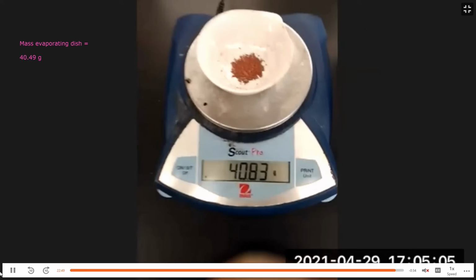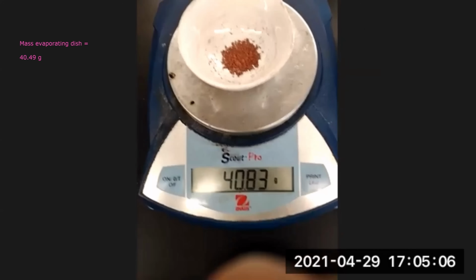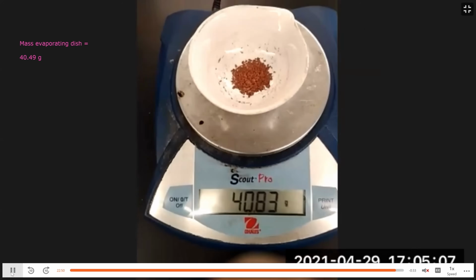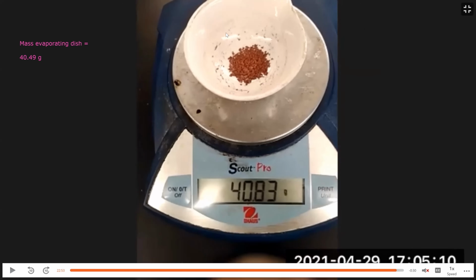So after drying it in the oven, you let the evaporating dish cool down to room temperature, and then you take the mass of the evaporating dish and the precipitate, copper. So here it's 40.83.